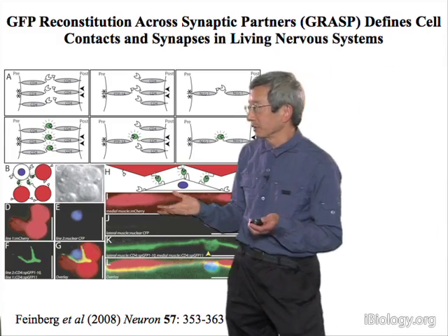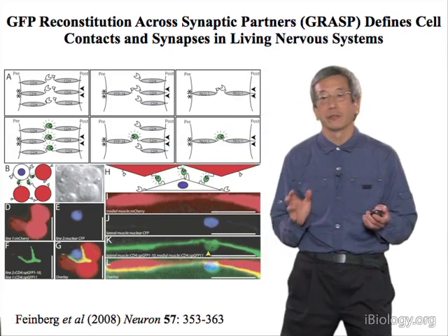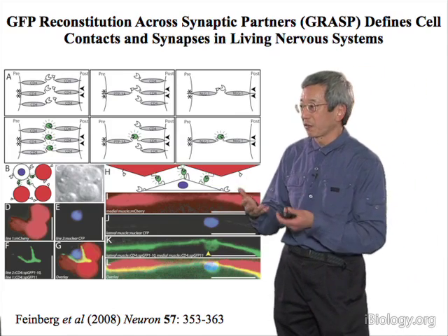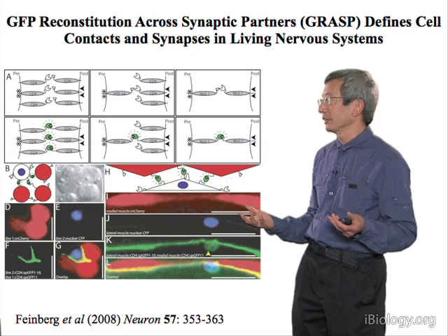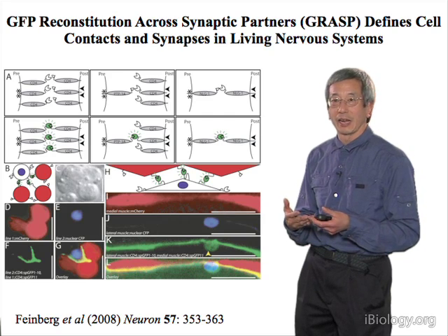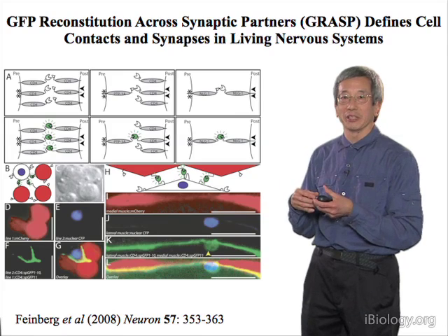My last example is now class 4, which I haven't talked about up to now, and that's the so-called bimolecular fluorescence complementation, where we take two fragments of fluorescent proteins that each by themselves is impotent, unable to make fluorescence. We clamp them together for a little while in proximity, in a strange variation on circular permutation, and these two fragments can now cooperate with each other.